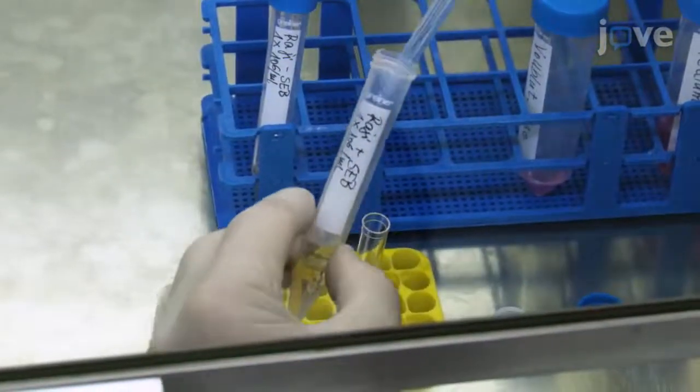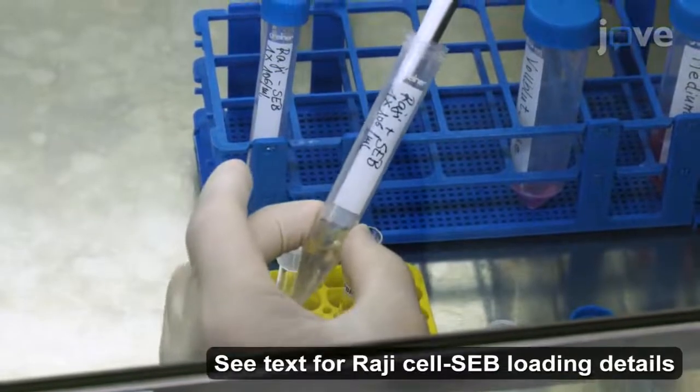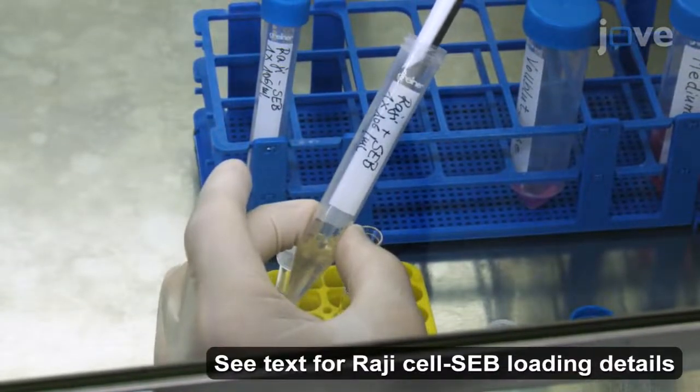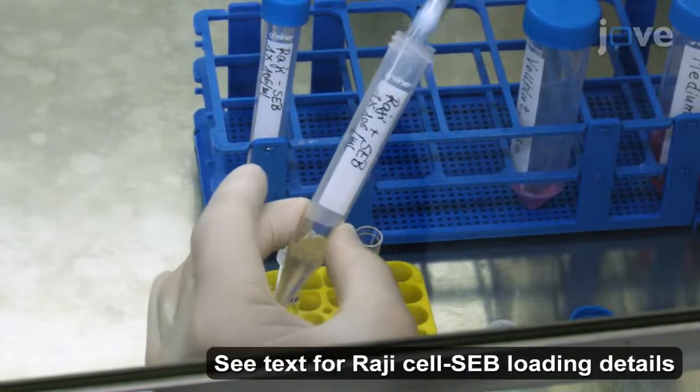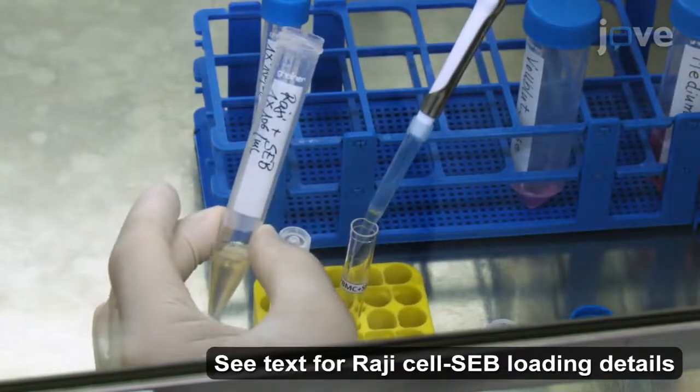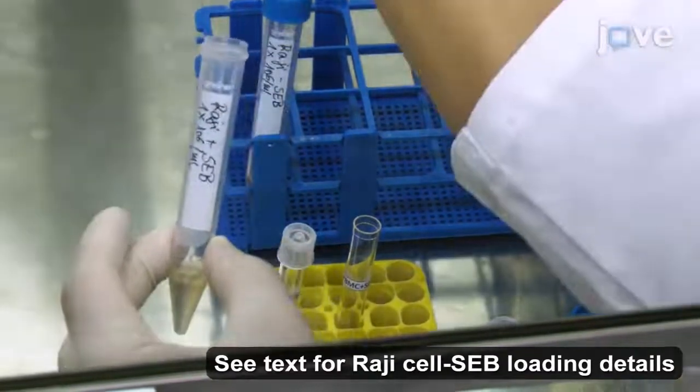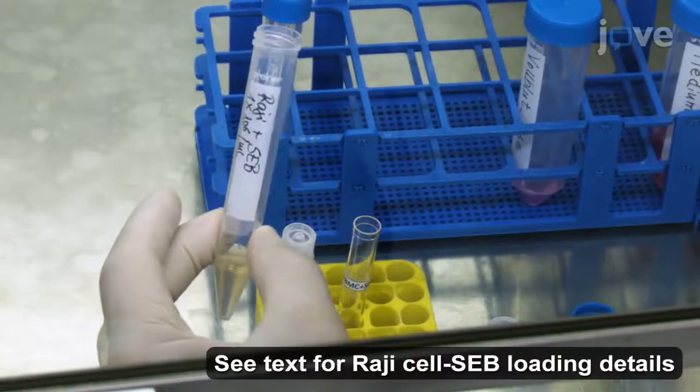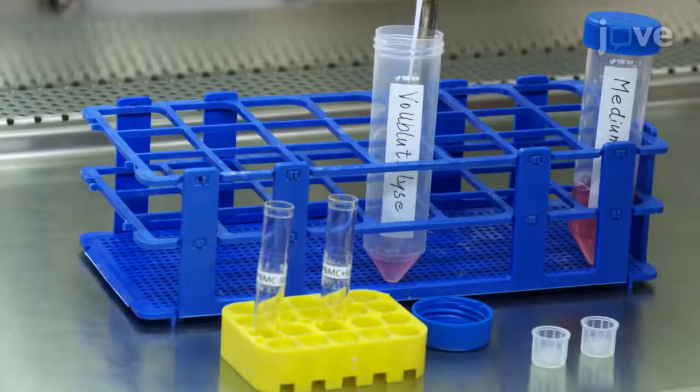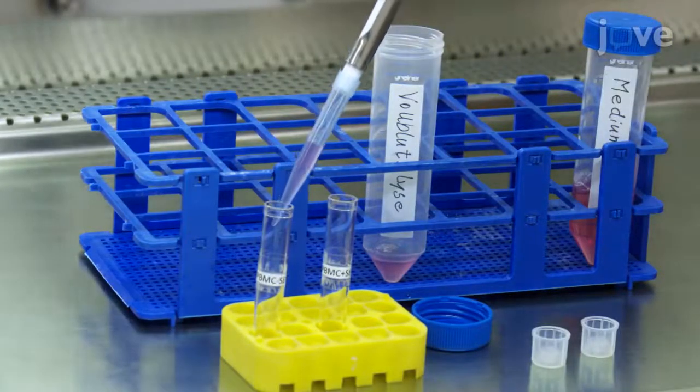At the end of incubation, add 5 x 10 to the 5th Staphylococcus aureus enterotoxin B or SEB loaded or unloaded RAGI cells in 500 microliters of culture medium into individual fax tubes, followed by 650 microliters of panleukocytes.